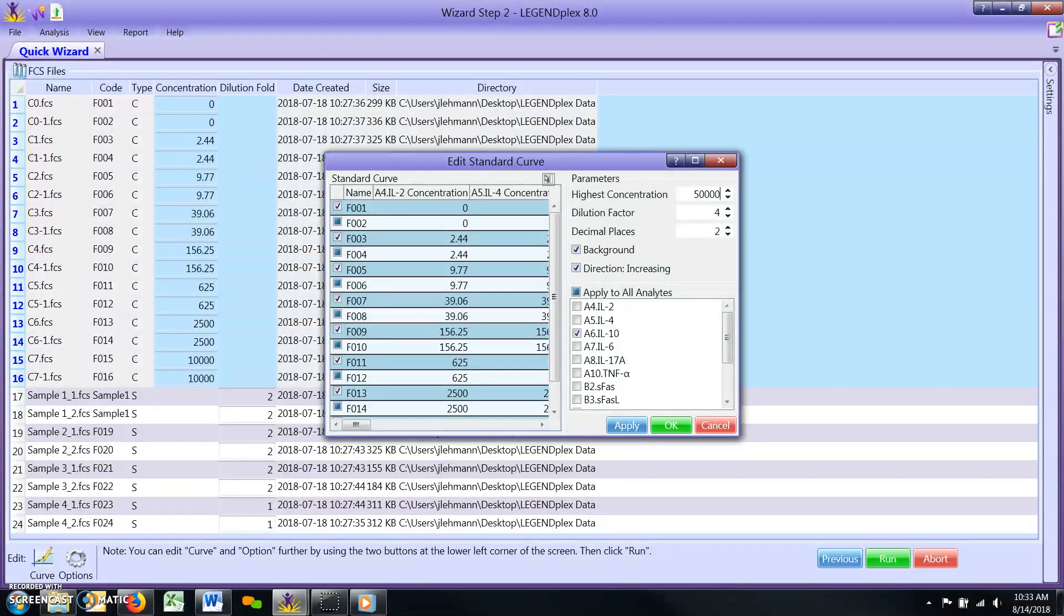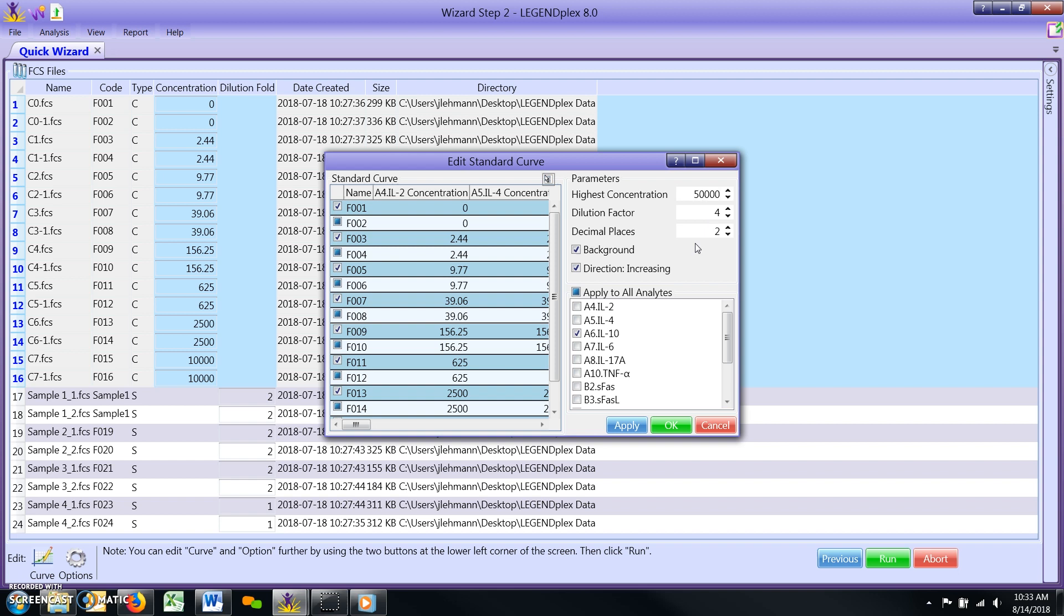If you ordered your standard curve files in decreasing order on the files list, i.e. from C7 to C0, please uncheck the direction increasing box. Click the blue apply button at the bottom to assign the new value.